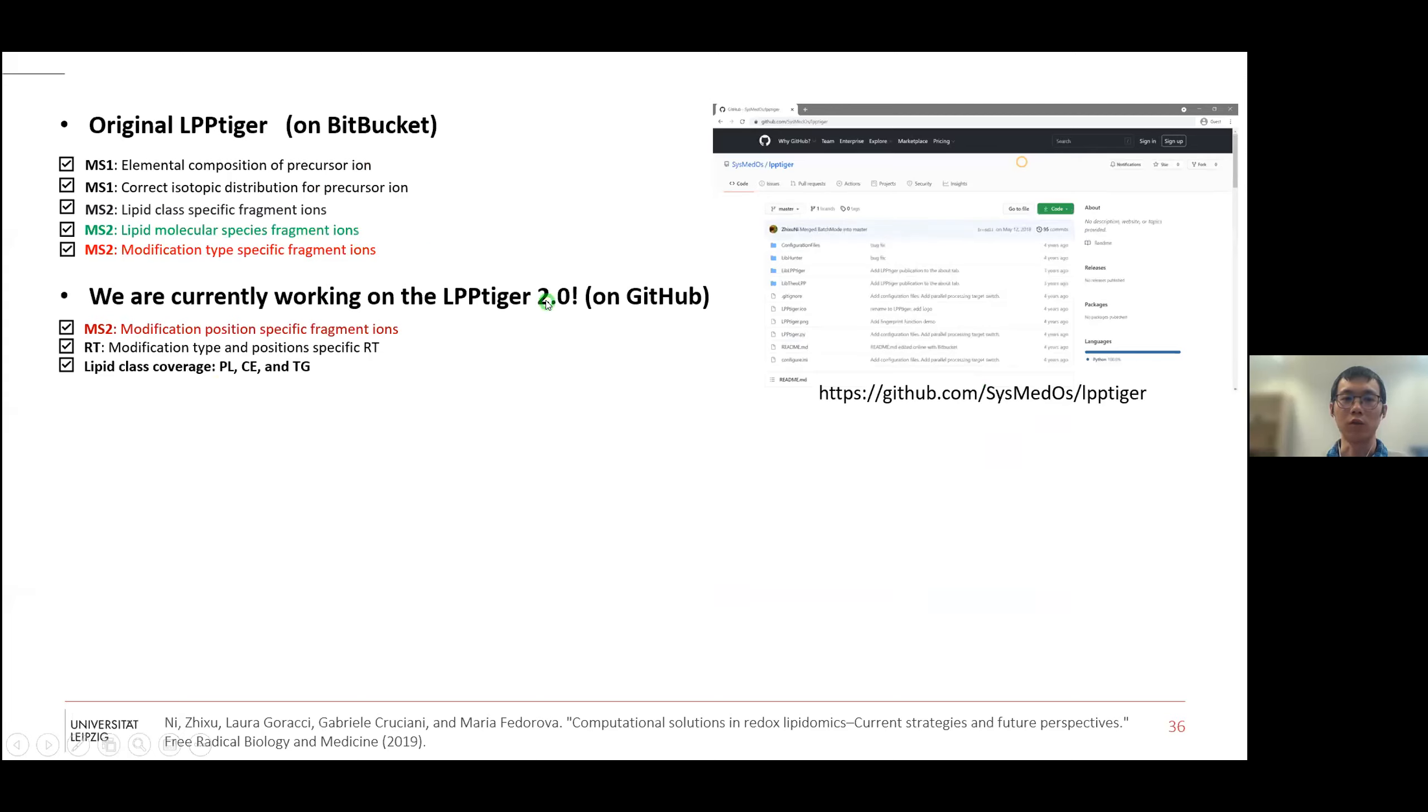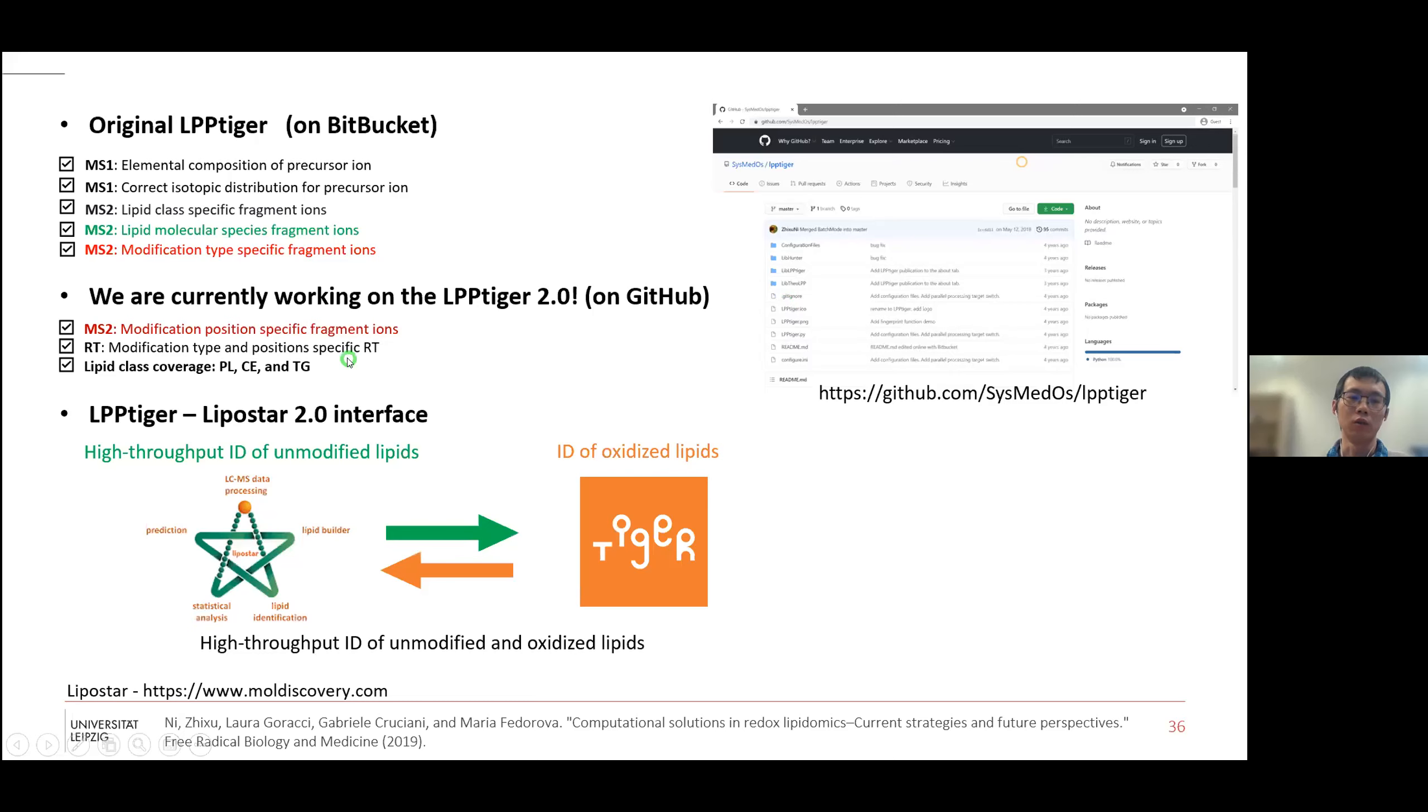We are working on the LPP Tiger version 2 on GitHub. This is the new website for version 2, which is different from version 1. We are closely collaborating with Lipostar team to try to make an interface between LPP Tiger and Lipostar 2. The idea is we use Lipostar for high-throughput identification of unmodified lipids. This result will be transferred to LPP Tiger to identify oxidized lipids to oxidation type level or higher. Then we can transfer it back to Lipostar for additional analysis.